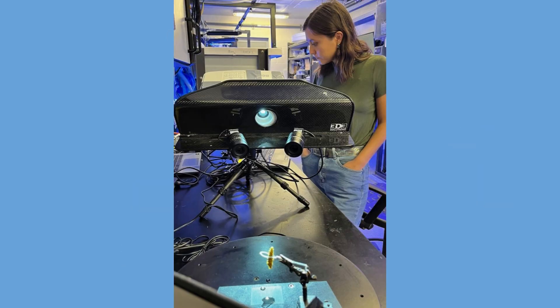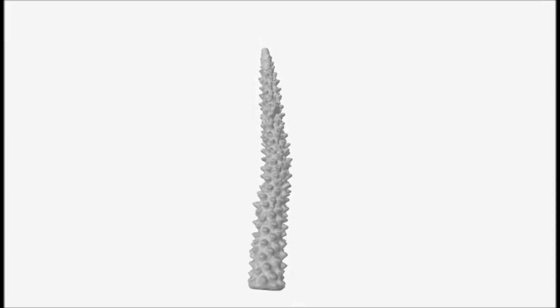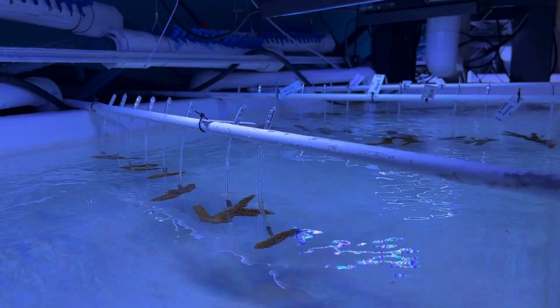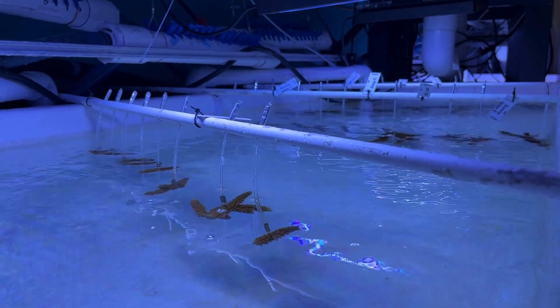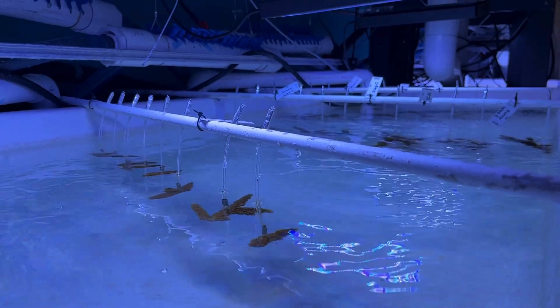In our experimental reef lab, AOML scientists use 3D scanning to produce high-resolution images to assess how environmental stressors affect coral growth rates. Repeatedly scanning coral fragments that are exposed to changes in temperature, pH, and light allows us to understand how they react to these varying environmental conditions.